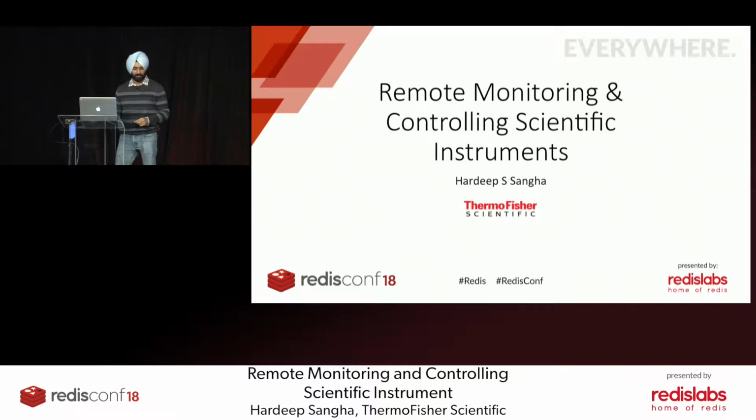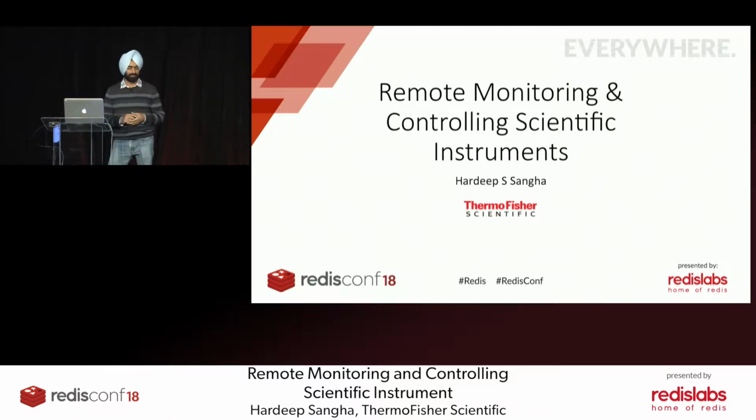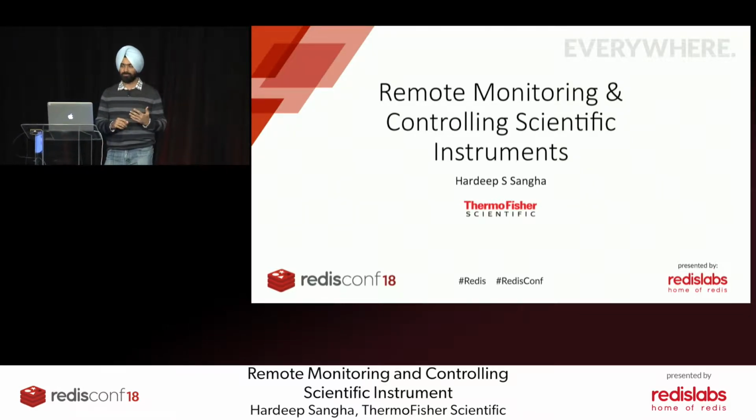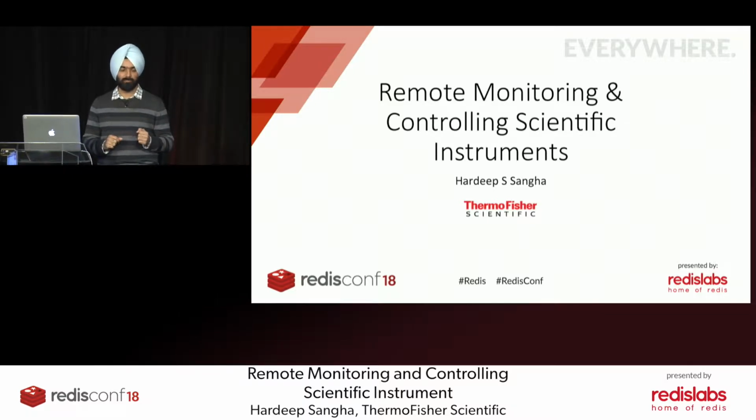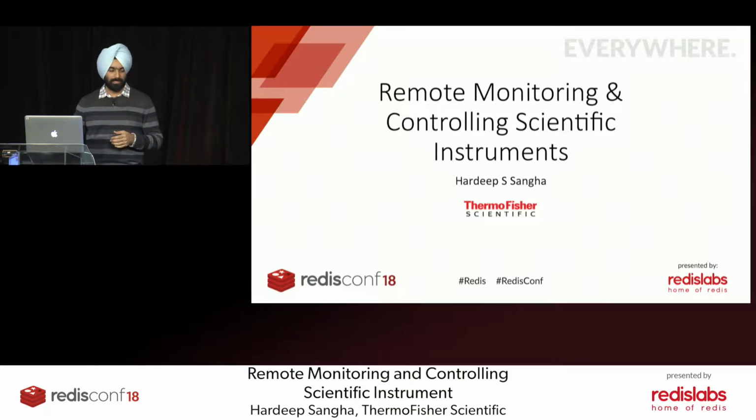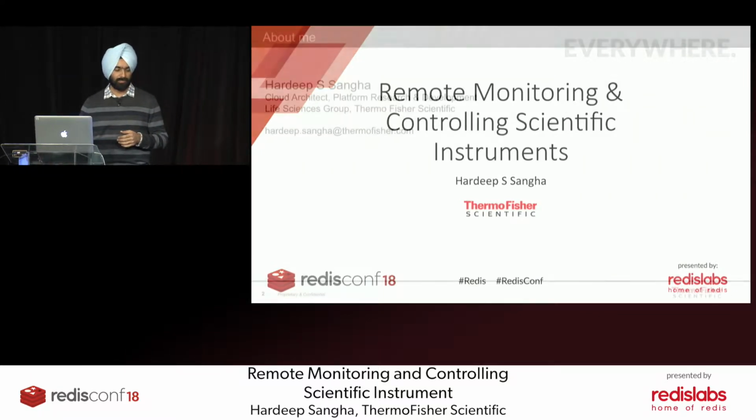So what I'm going to talk about is the remote monitoring application, not only monitoring the scientific instrument, but also able to control it to some extent. Let's get started with that.